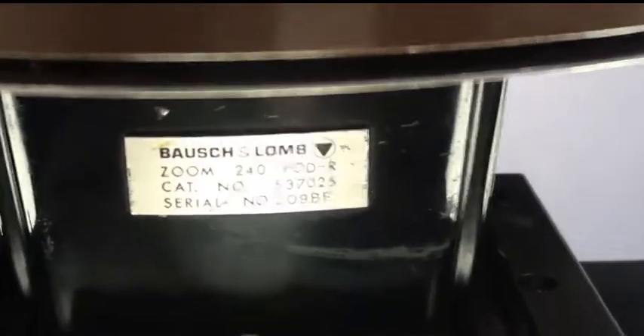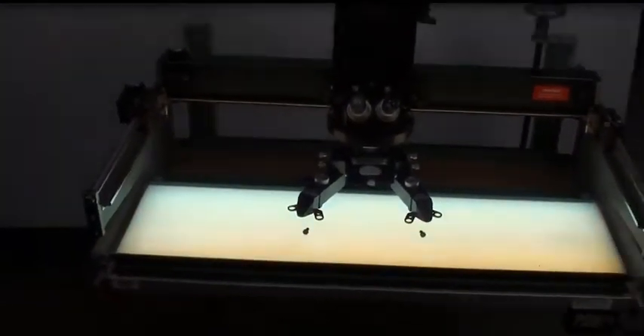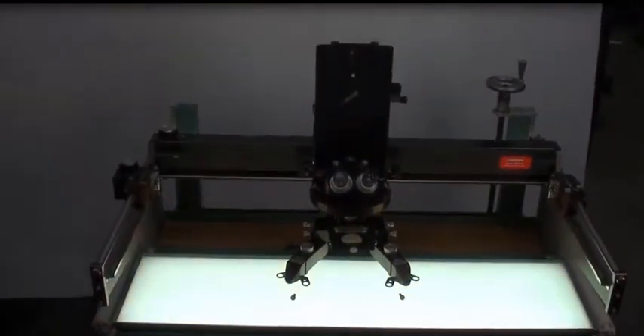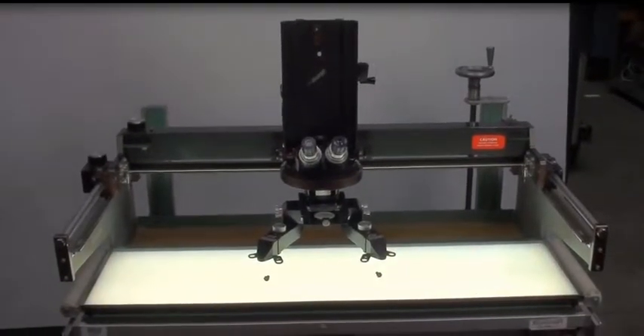The microscope has this plug here that we are not able to plug in but it looks to be accessible. There's some odd number right here.